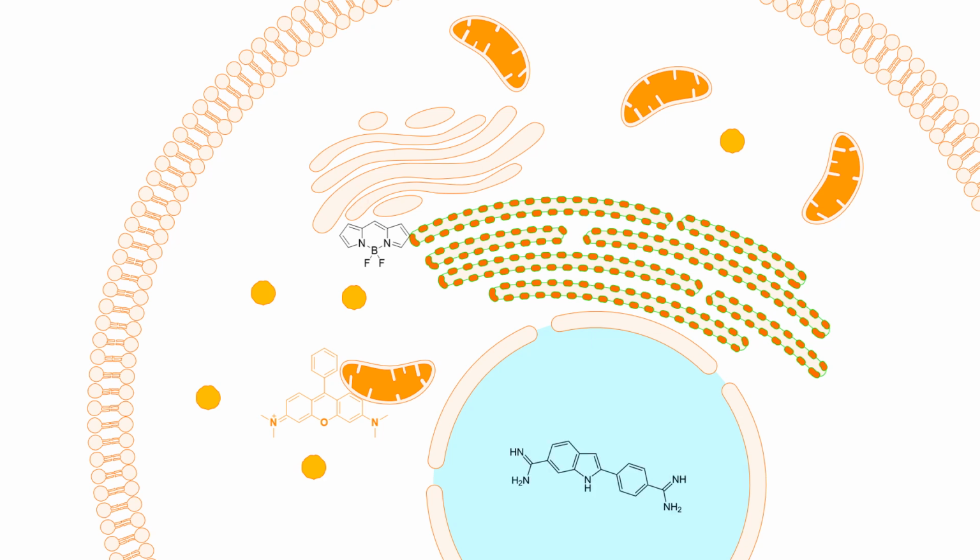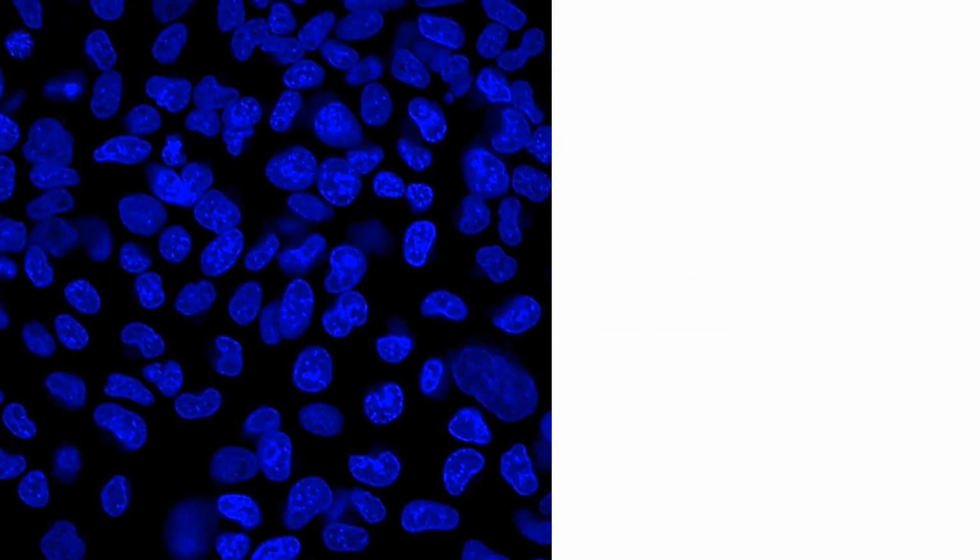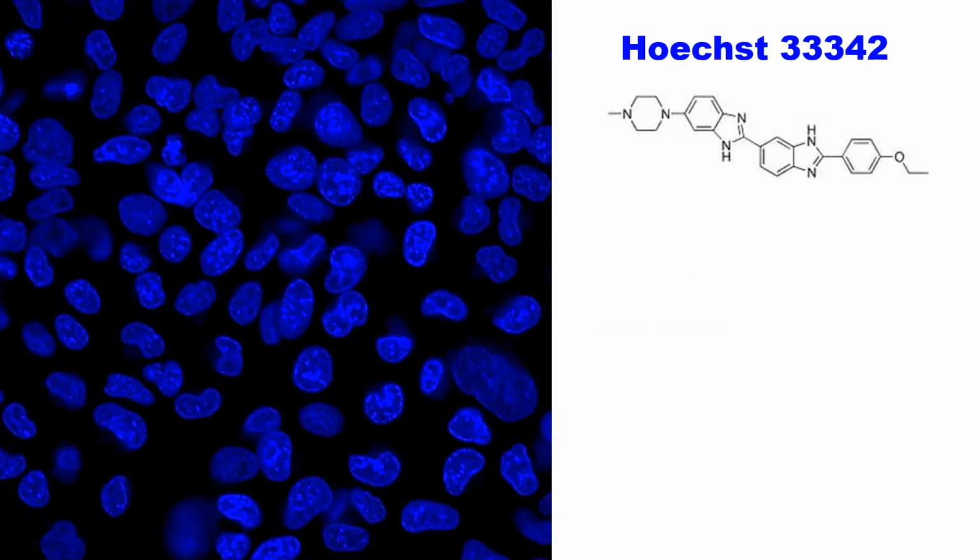If the molecule has a very strong binding partner, such as DAPI or Hoechst, which bind to the DNA, then by chemical equilibrium, they can accumulate inside the nucleus. This is a nucleus staining by Hoechst. Hoechst is a blue dye with a strong binding affinity to the nucleus, and it can stain live cells and dead cells. It is a very powerful nucleus dye.